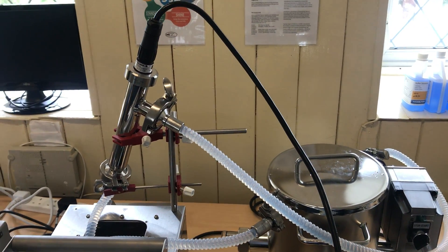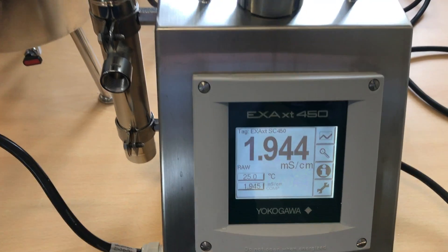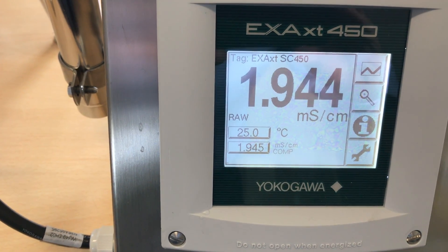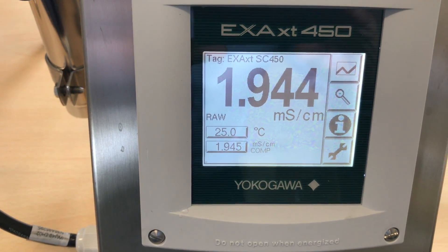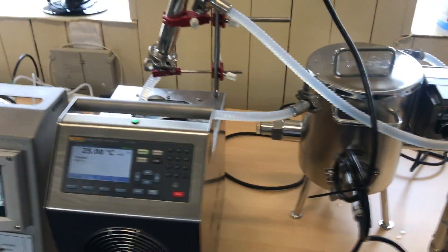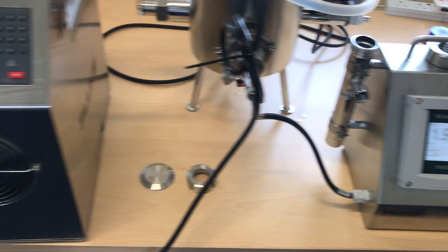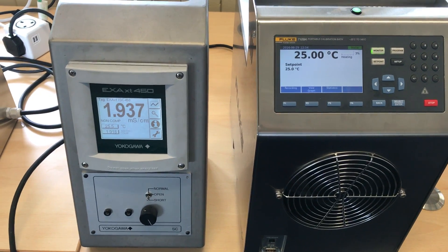This is our INSECAL master reference, which is displaying both raw and compensated values that are pretty much identical, given the fact that the temperature is within 10 millidegrees. We're seeing 1.943 millisiemens — very, very stable — and we've got 1.937 on the unit under test in its raw value.